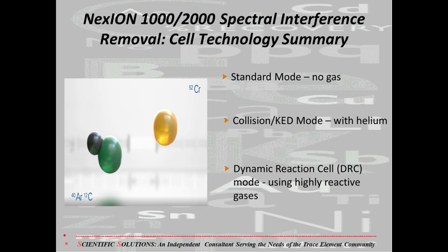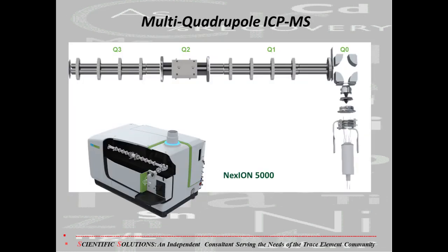It is known as an active collision reaction cell because a bandpass can be selected to stop the formation of interfering ions, as opposed to a passive cell using higher order multipoles such as hexapoles or octapoles that just act as a simple ion guide, allowing all ions through to the quadrupole analyzer.